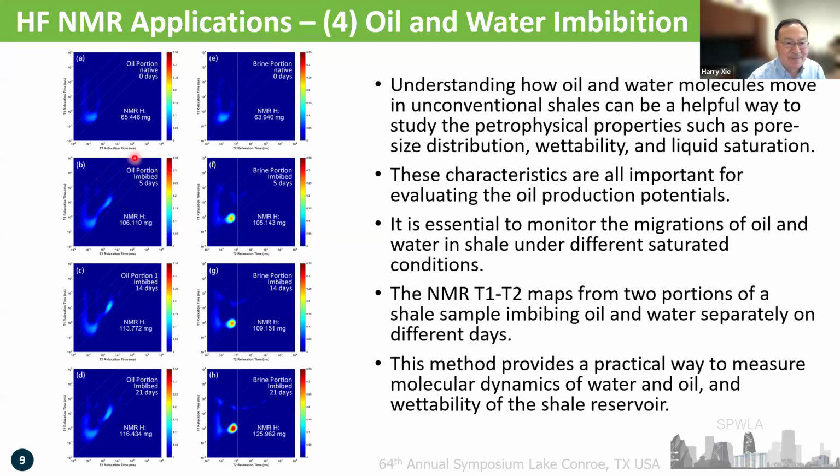You can tell the saturation process takes a long time. This is 21 days and still going on. If you look at the numbers, this is the total NMR measurement, how many milligrams in this signal, from 65 to start with, all the way to 116. And the same for this one, a similar sample size and a similar sample, with a 64 milligram signal going to 126 milligrams of water. You can see water can get into this place, and it is easy to see where it stays.